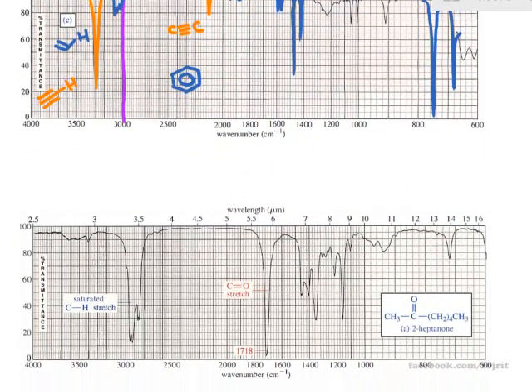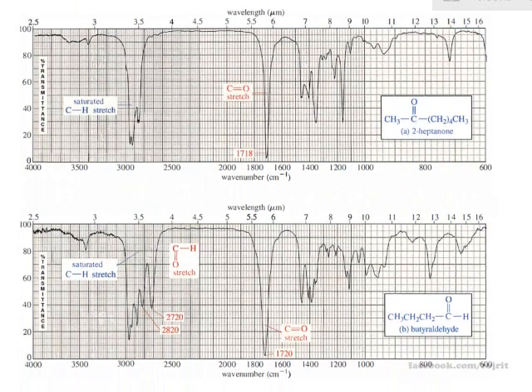Next, the functional groups are the ketone and aldehyde, which I want to talk about together. Ketone and aldehyde are very similar because you have the carbonyl group. The carbonyl appears in the double bond region, but its character is a very strong absorption, because the carbonyl is very, very polar, right? Oxygen has a very high electronegativity compared with the carbon atom. With the very high electronegativity, this double bond is very polar and interacts with the electric field of the IR wave, the IR frequency. So we have the strong absorption of the carbonyl.